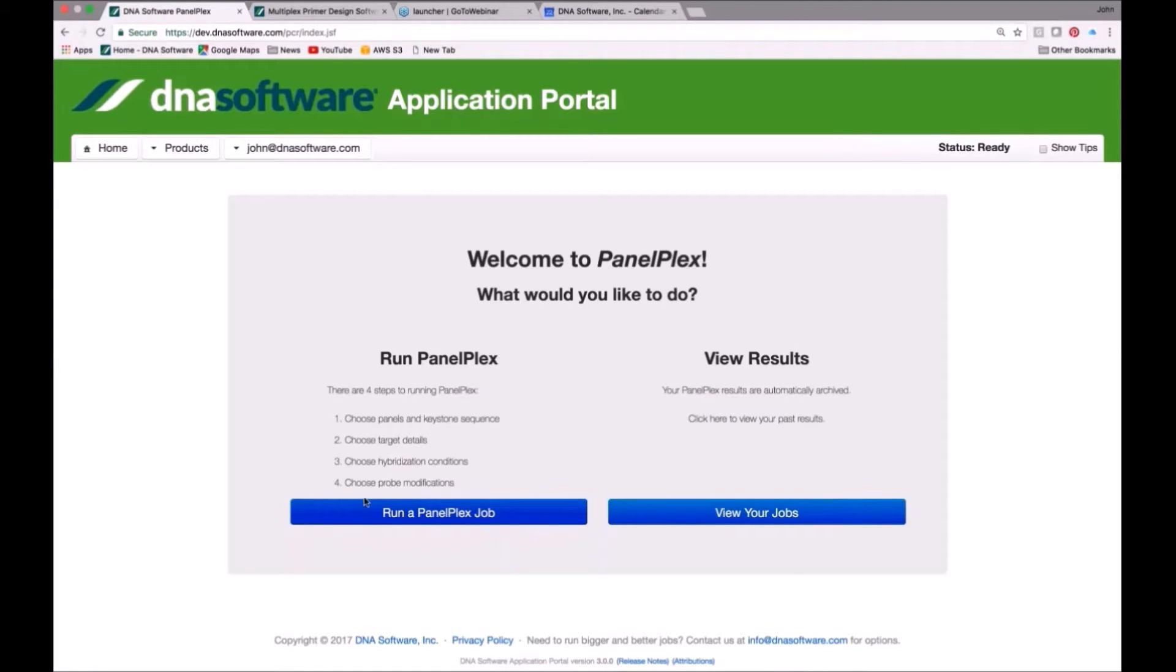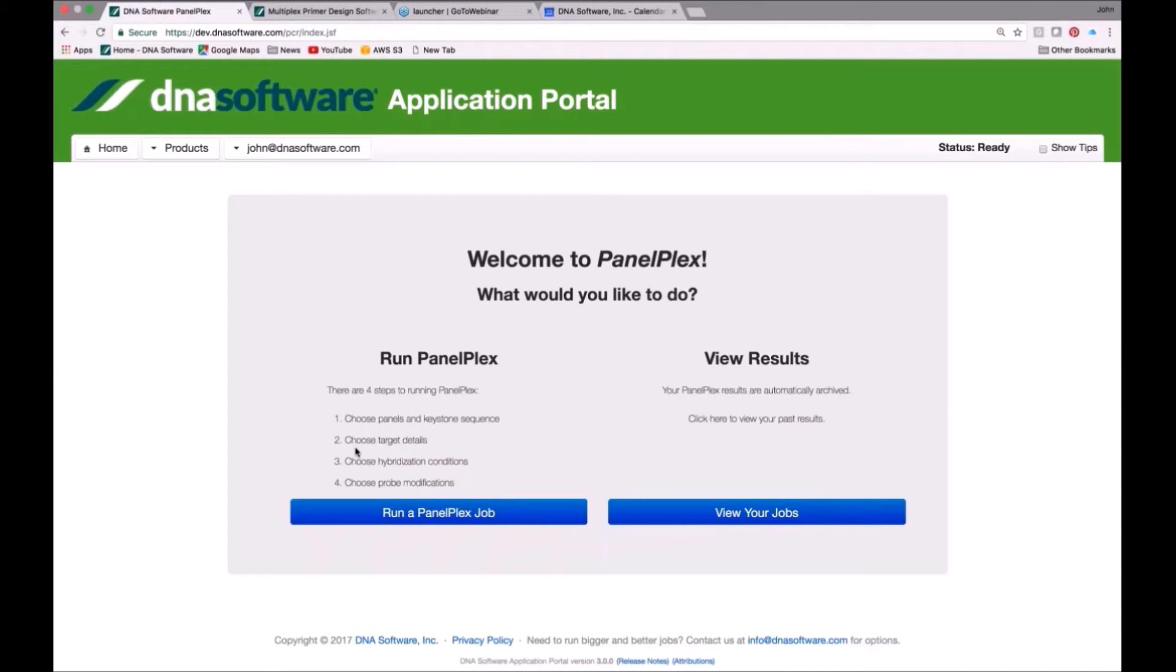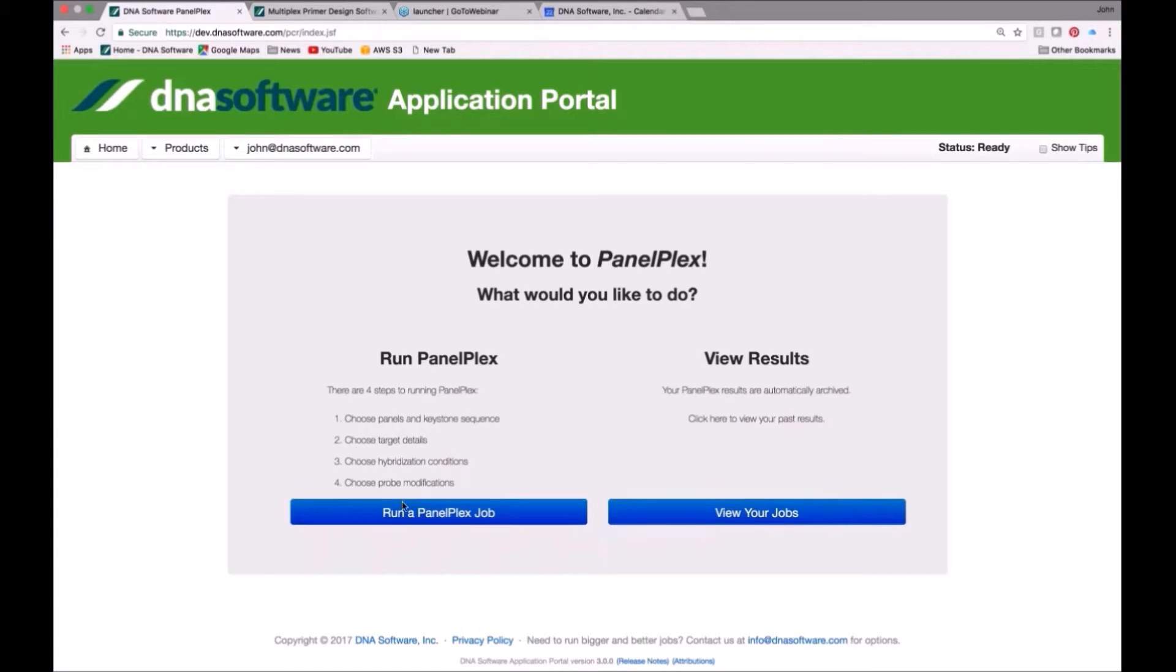PanelPlex has four different steps. First, we need to choose our panel, our playlist, the inclusivity, exclusivity, and background, and we need to choose this thing called the keystone, which I'll explain in a moment. Once we've entered those, we'll be talking about the details of the target. Either do we want a design to the whole region, or the whole target, or a region of the target. And we'll give the hybridization conditions and any probe modifications.